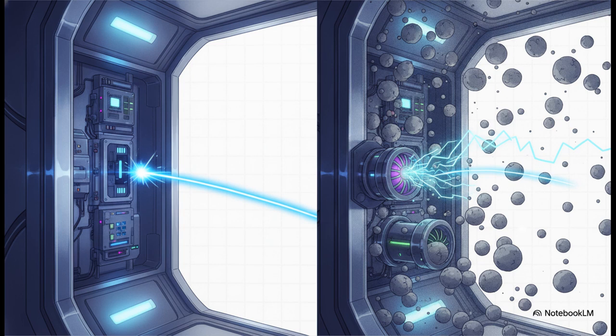We're talking pressures between 10 to the -9 and 10 to the -10 millibar. Why such an extreme vacuum? Well, if these ejected electrons were to hit any stray air molecules on their way to the detector, they'd scatter. They'd lose energy, and it would completely ruin our measurements.